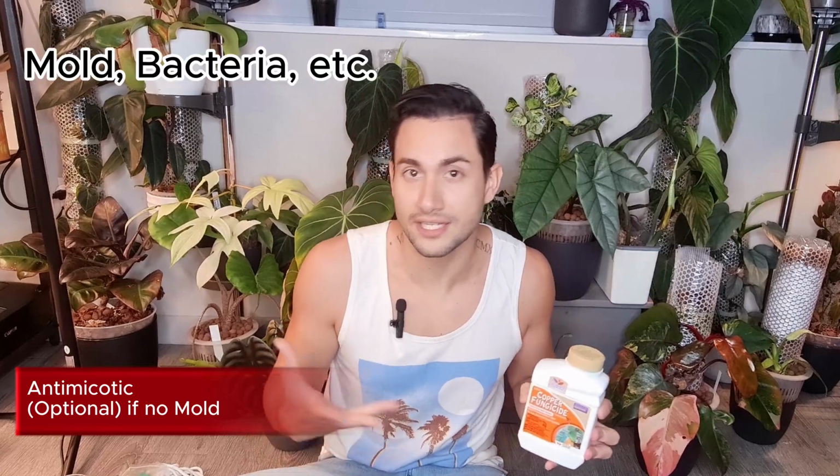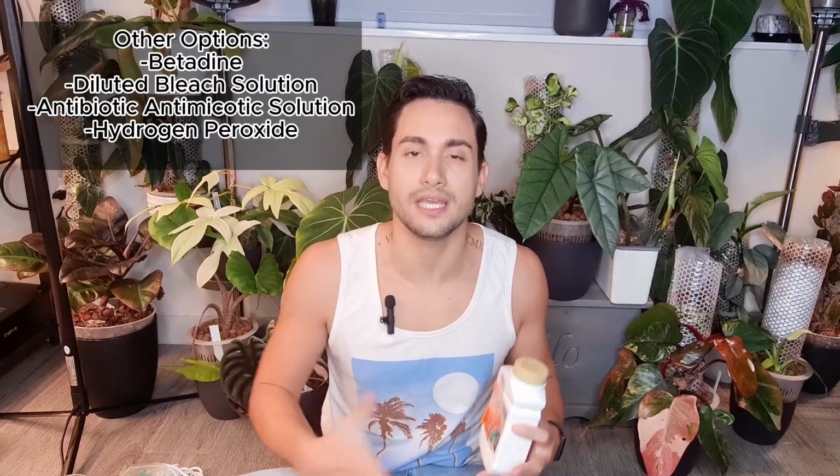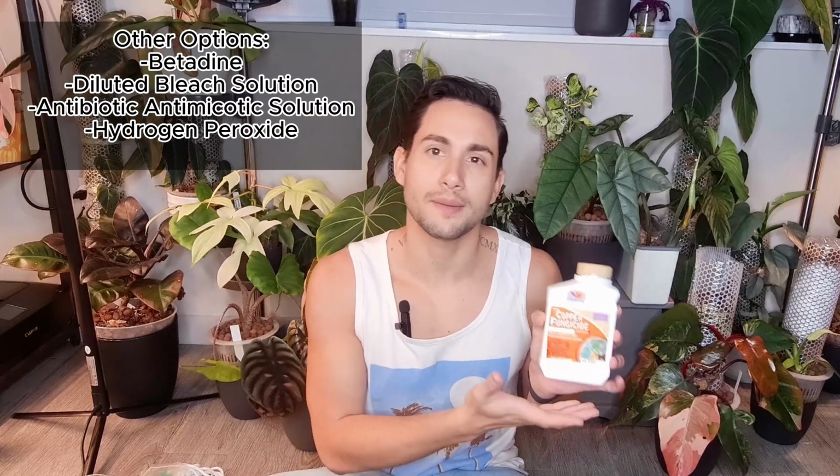Then if you're dealing with contaminated tissue culture, you need to do something for the mold that is growing in there. You can't just wash it. You need to ideally give it some kind of bath to clean it out. There's multiple things that you can use, but I found a research paper where they were talking about using this kind of copper for tissue culture plants to prevent the growth whenever they're contaminated. And I liked it enough to use it, and so far it has been really helpful.